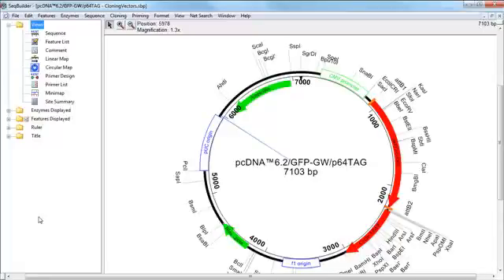When you're preparing an image in SeqBuilder for presentation either digitally or in print, you may want to rearrange or edit some of the annotations that are displayed on your sequence.